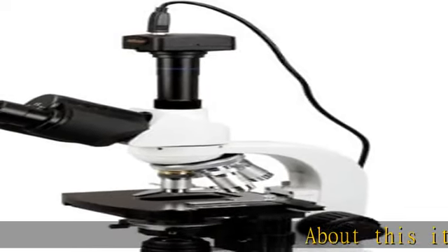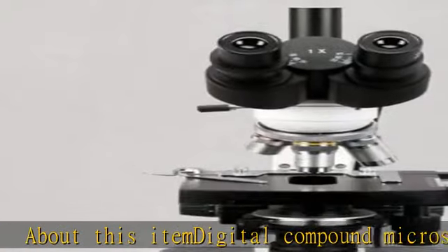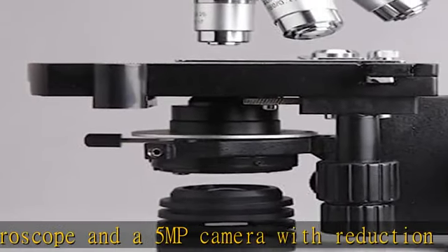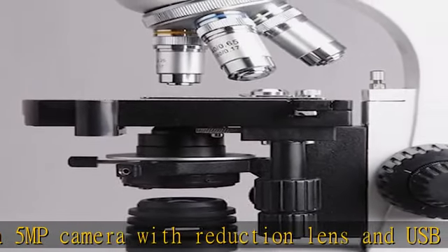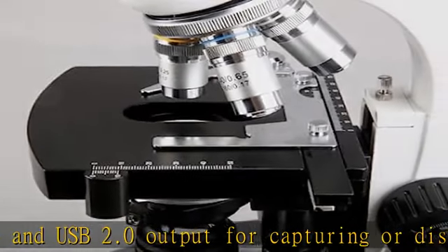Digital compound microscope with a 5MP camera, reduction lens, and USB 2.0 output for capturing or displaying images on a computer or projector. Siedentopf trinocular viewing head with pairs of 10x and 20x wide field eyepieces and 48-75mm interpupillary adjustment.